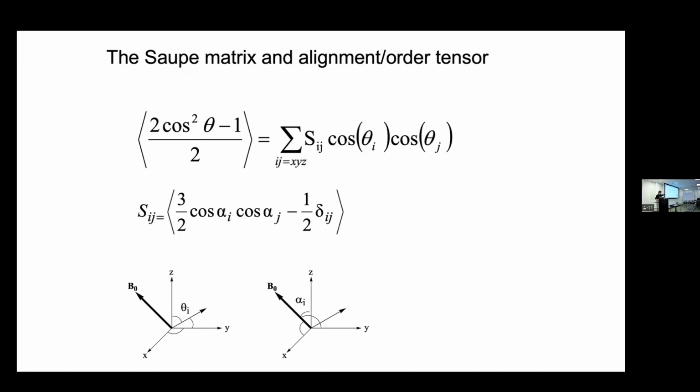Now, the one we're talking about here is the alignment tensor, which is unique because it has the largest direction of order, and then one can diagonalize this and get the analysis. So the point being that the angle alpha, the projection, once I know the alignment tensor, then a given RDC constrains the orientation of bond vectors relative to the alignment tensor.